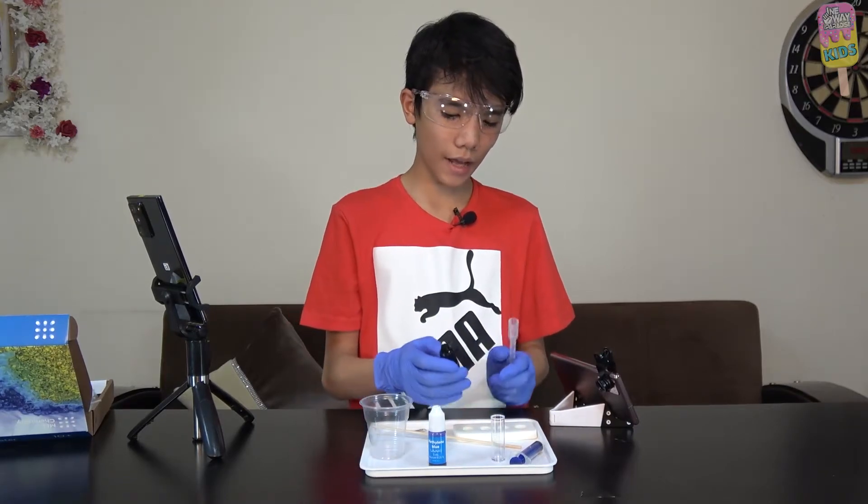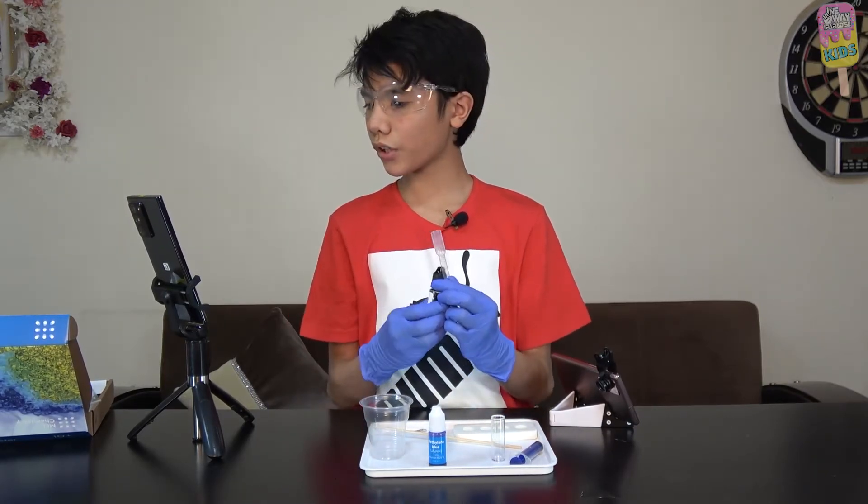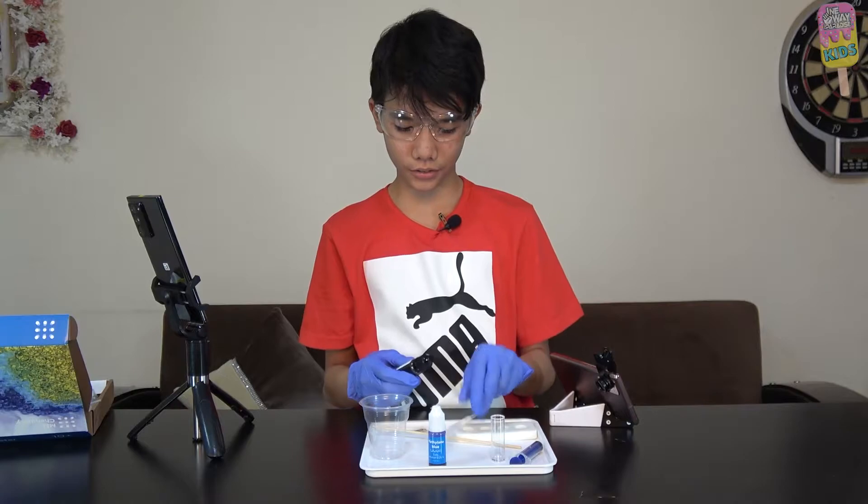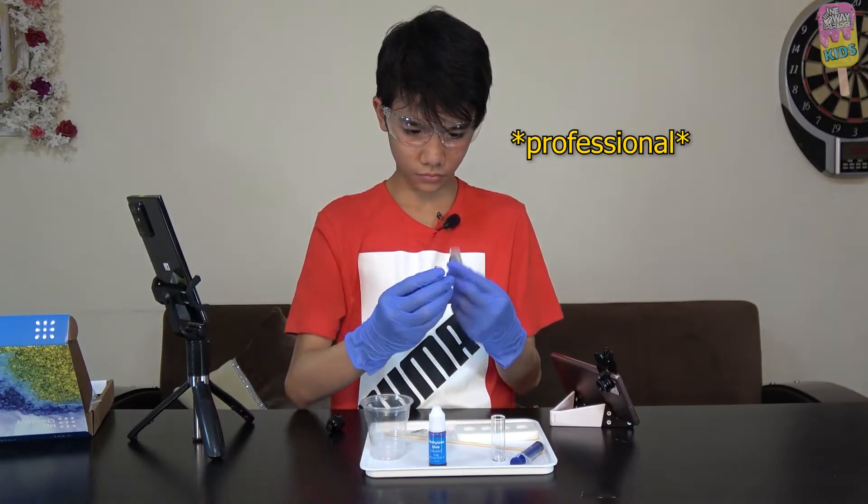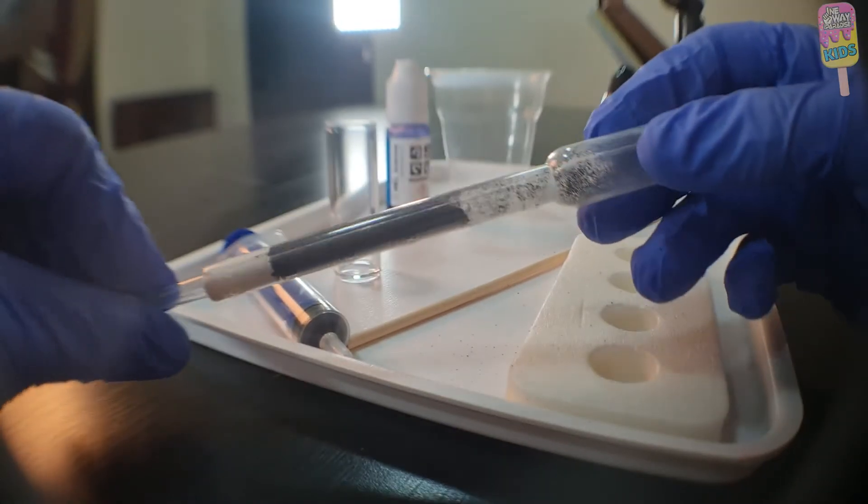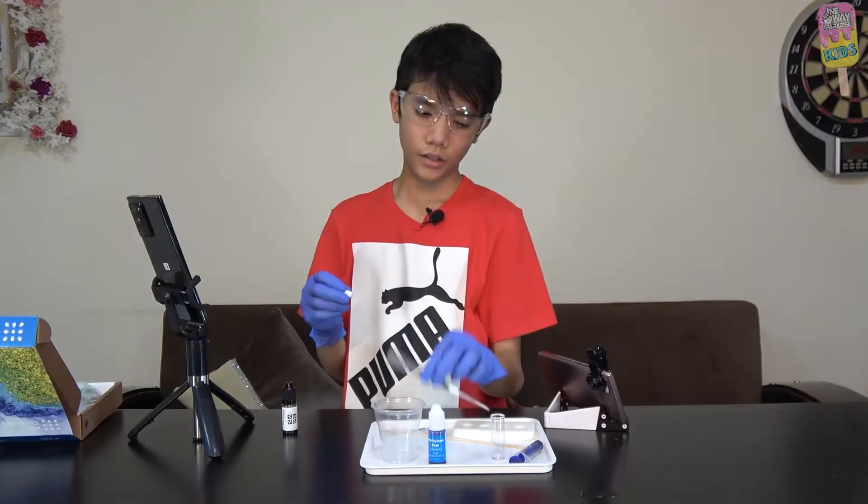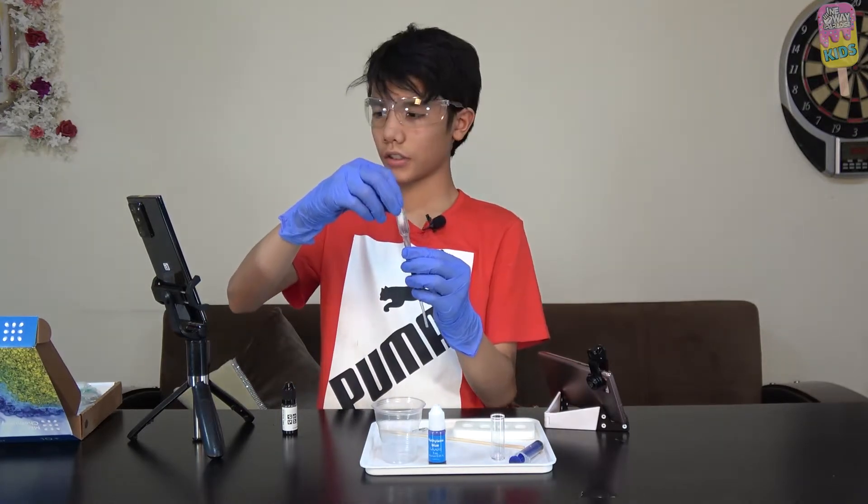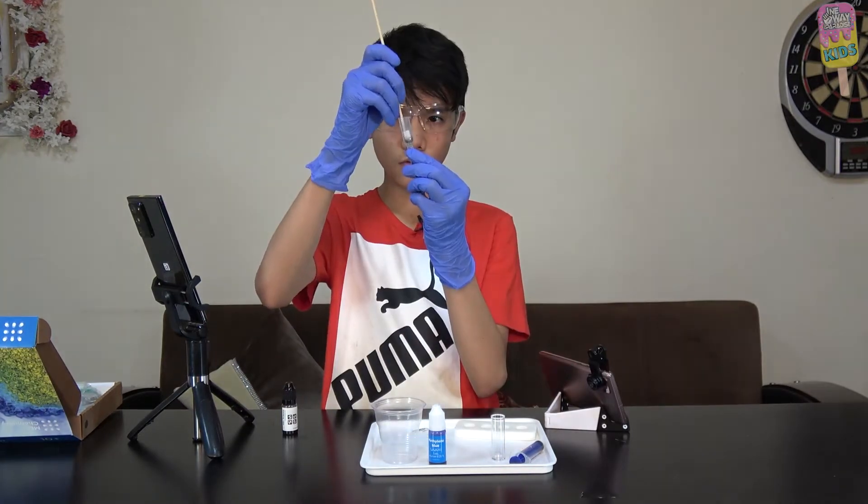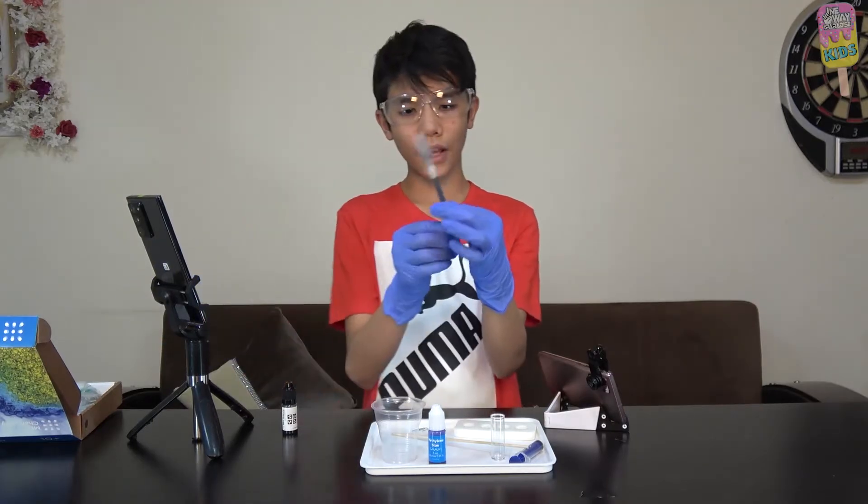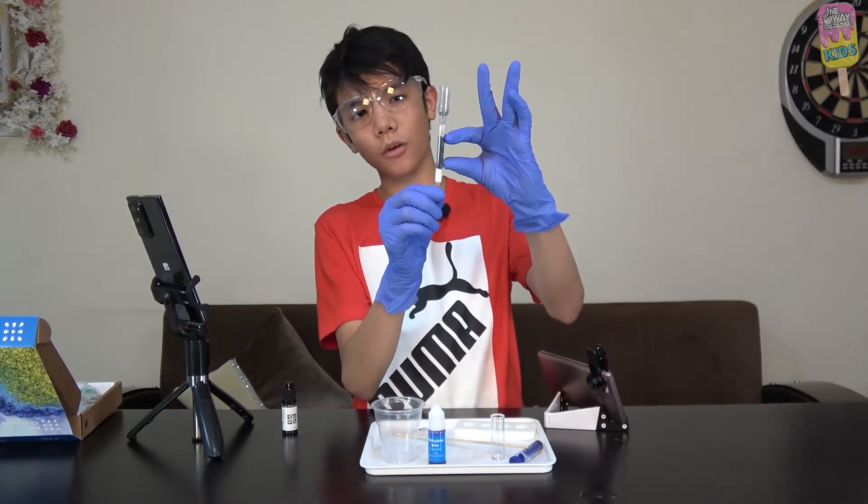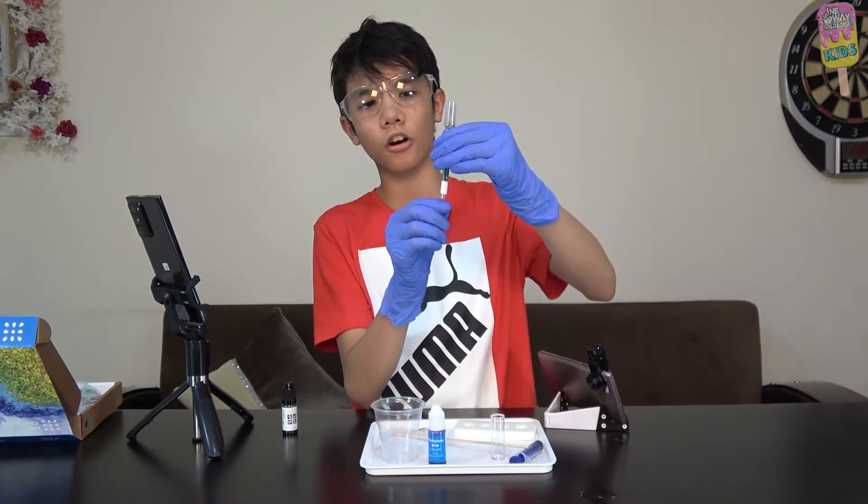Next, we're going to get some activated carbon and pour it up to the 2.5 mark. There, I filled some activated carbon up to the 2.5 mark in the pipette. Next, I'm going to insert another cotton cylinder. Now we have a cotton cylinder, some activated carbon in the middle, and another cotton cylinder on top.